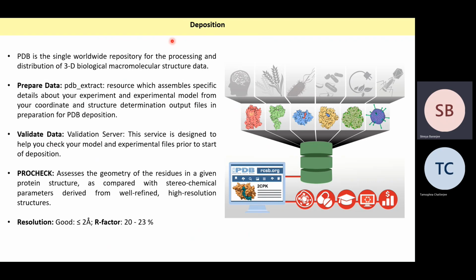Finally, now that all the work of interpreting the X-ray diffraction data, forming a structure, refining the structure, and all that is done, the structure is deposited in the protein data bank, which we have learned is the single worldwide repository for the processing and distribution of 3D biological macromolecule structure data.